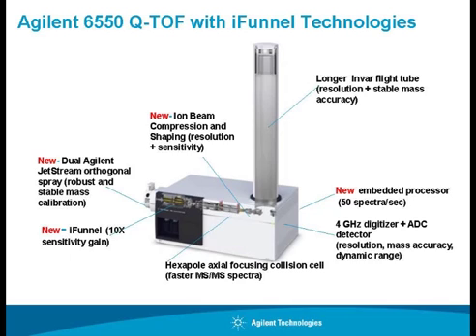But we are saying here that my mass spec cannot see mass as such. It has to be charged, meaning the language which my LC is talking cannot be understood by my mass spec, isn't it? So we need an interface, which is called an ion source, which we just now saw, or in this case electrospray ionization. That is an interface where the liquid is evaporated and only charged analyte, in this case peptides, gets into the mass spec, which is under high vacuum. Okay, and it travels through the quadrupole, then you can trigger an MS-MS and then it can be measured in the time of flight. Okay, so why quadrupole and why time of flight, maybe we will discuss when we actually go into the lab, where you can see the various modes and realize why not only TOF. If TOF can do everything, as I told, accurate mass and resolution, then why do we need a quadrupole? Okay, so we will see that.